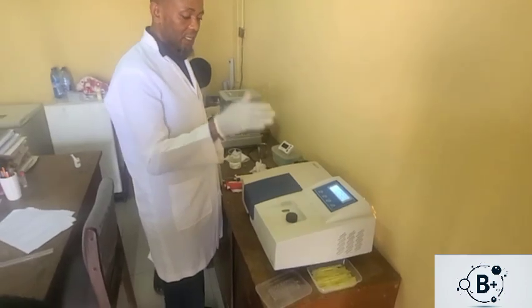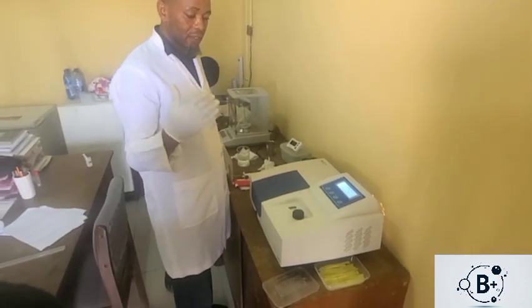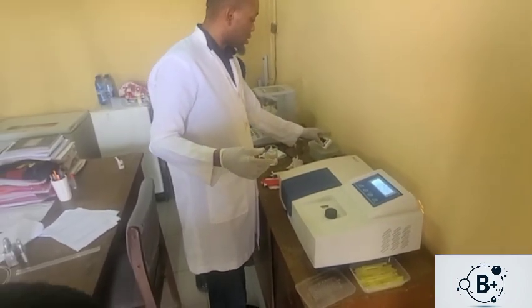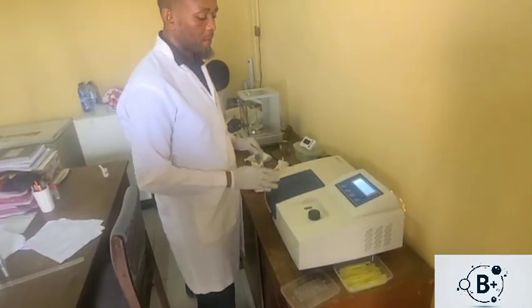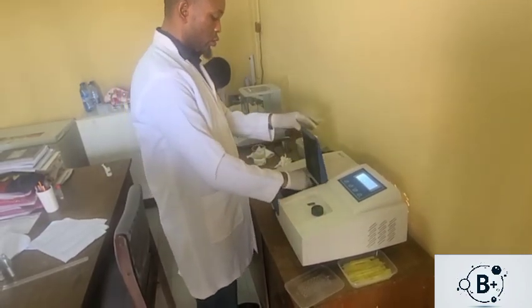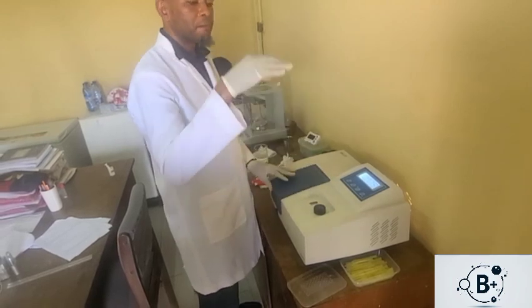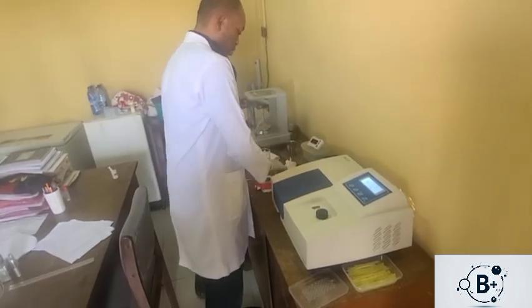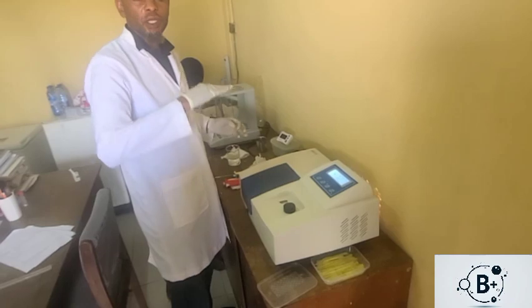After that has been run and recorded, we can start with the main analyte, which is our real test samples. This is the last one. Okay, so that is that. Once this is done, we do this process for all samples. Once it's done, we empty it and we start the process again.